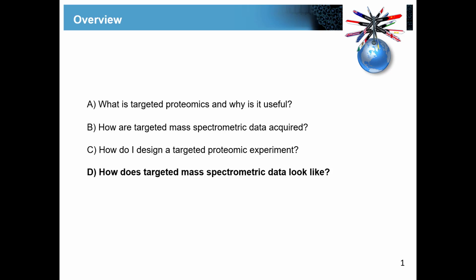The Y ions for SRM. On our Q Exactives or Q Orbitraps, the fragmentation mode is quite a bit different, even if you use HCD mode, but still people have seen that the Y ions are more conserved than the B ions.